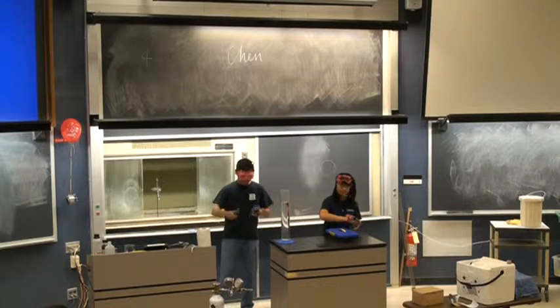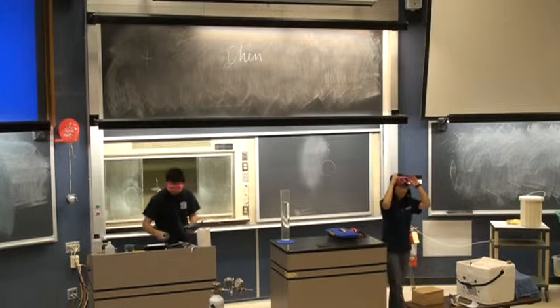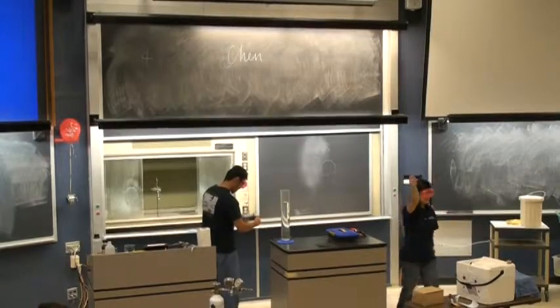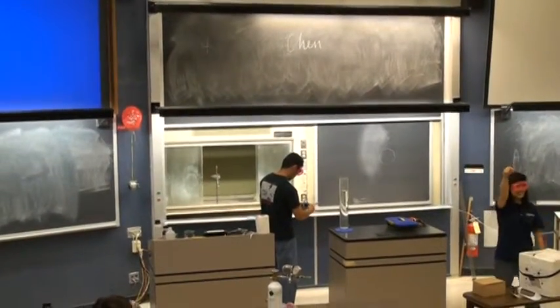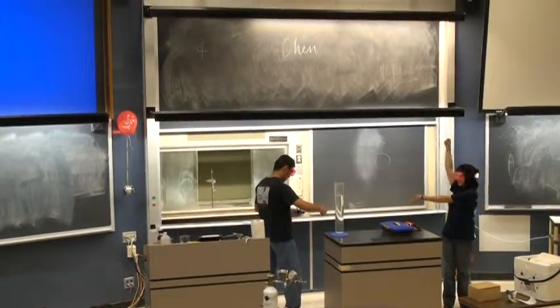I'm just getting hot water. So I'm going to choose a little gummy bear right here. Everyone want to give it a name? Freddy? Okay, so we're going to give Freddy a nice warm bath in some potassium chlorate.